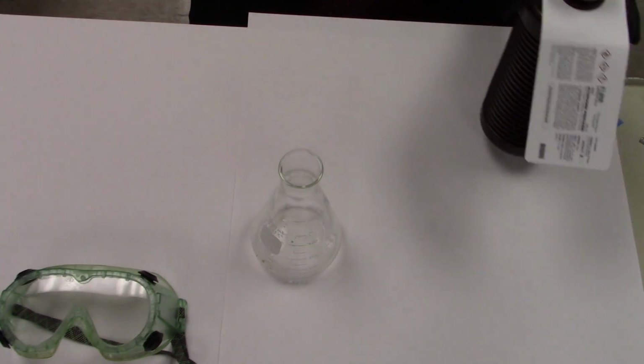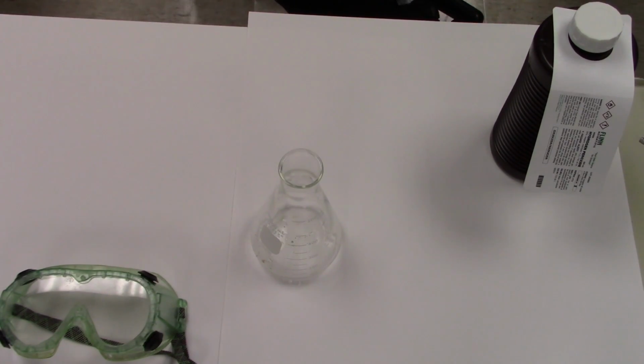All right, so elephant's toothpaste. This reaction is what's called a decomposition reaction. So when something decomposes, what do you think of it doing? Dissolving, breaking down, right? In chemistry, decomposition reactions are when things break down.